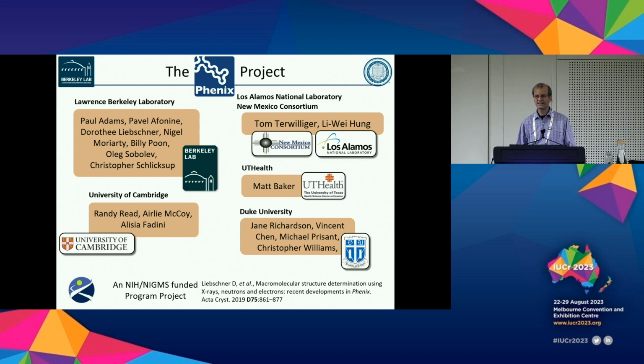I didn't quite get it, but I think you're asking, can you use multiple templates? To generate one AlphaFold model? Yeah, you can do that. You can actually supply as many templates as you want. And if you wanted to supply templates with different conformations, you could do that too.